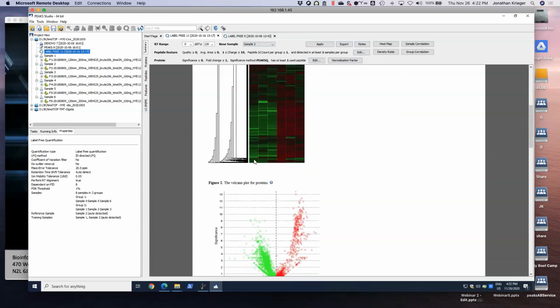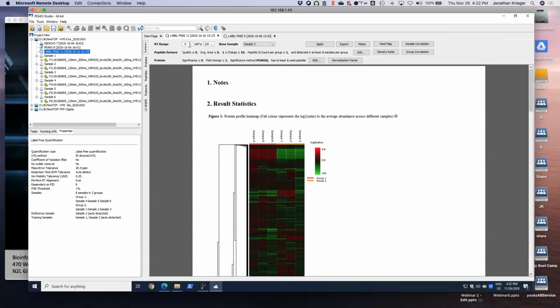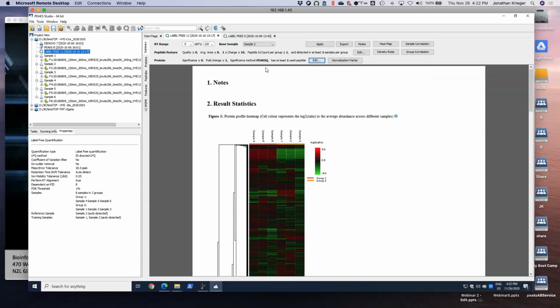But if we look at the label-free quantitation from this data, what we're showing here is basically everything. When a label-free quantitation opens, the defaults are quite high, with a significance of 20 and a fold change of 2, the bolded ones. That's because we really want to right away highlight what's different across your groups. But a lot of people ask us, how do I see everything? To do that, you just drop the filters down, and you should see everything.